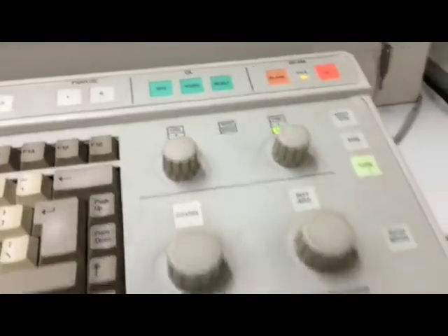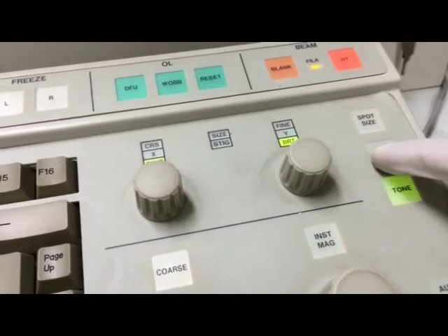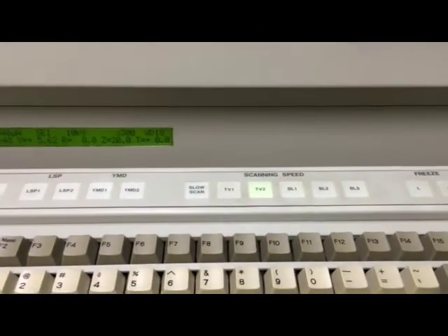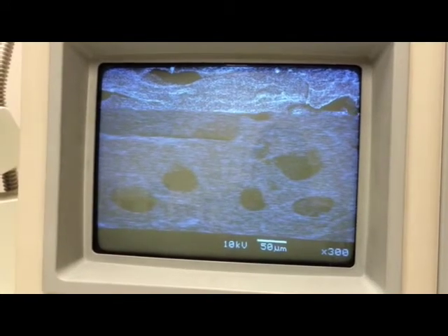The second step: after you choose the auto image, let's start again. Use automate for contrast and brightness. You can also change the stigma here to make the image finer. Please read the manual for details. After everything looks good, just press SL3. This is my final result.